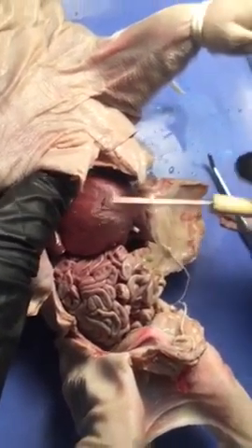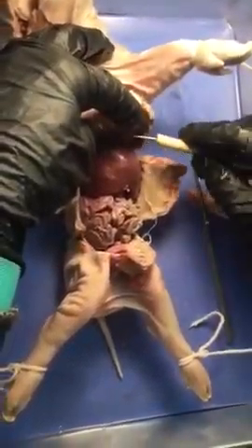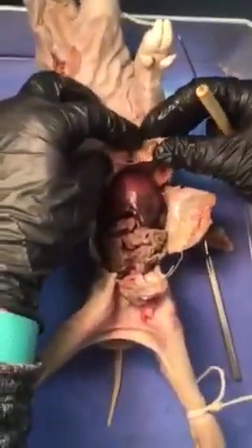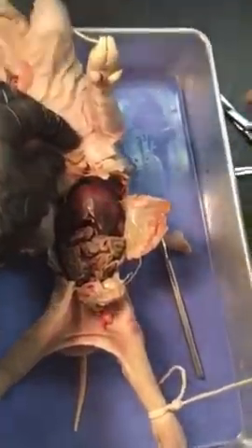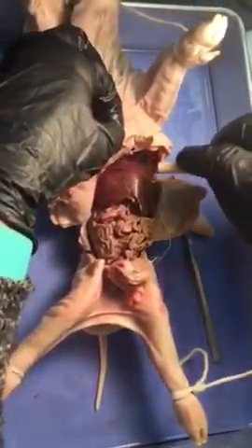The visceral layer. Okay, so of course this is the liver, and the muscle here is the diaphragm. If we lift this up, the diaphragm is just above the liver. The diaphragm is a transverse section that separates the thorax from the abdominal cavity. Exactly. I couldn't have said it better myself. So, again, you've got peritoneum over it, and then behind that you've got the diaphragm.